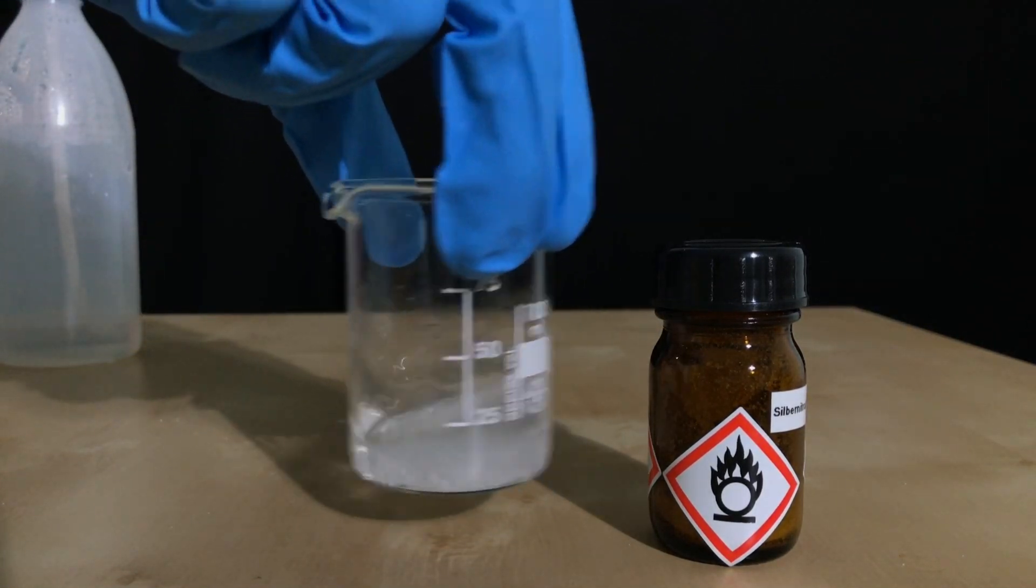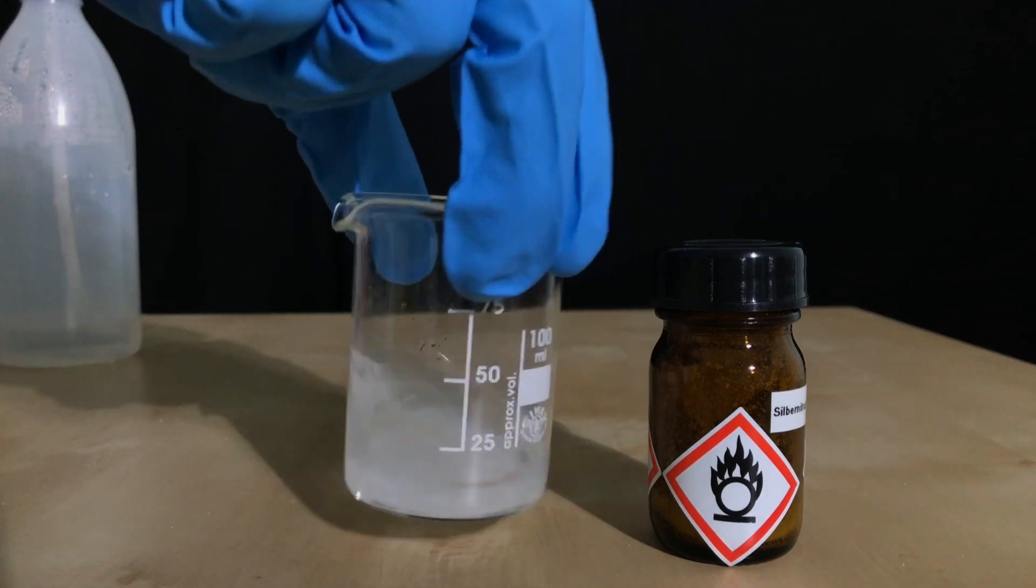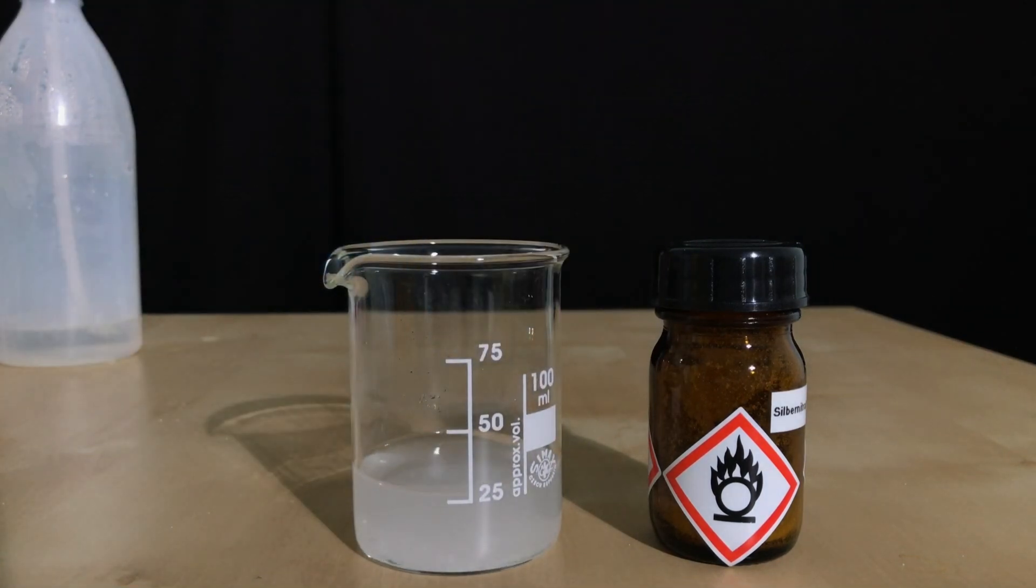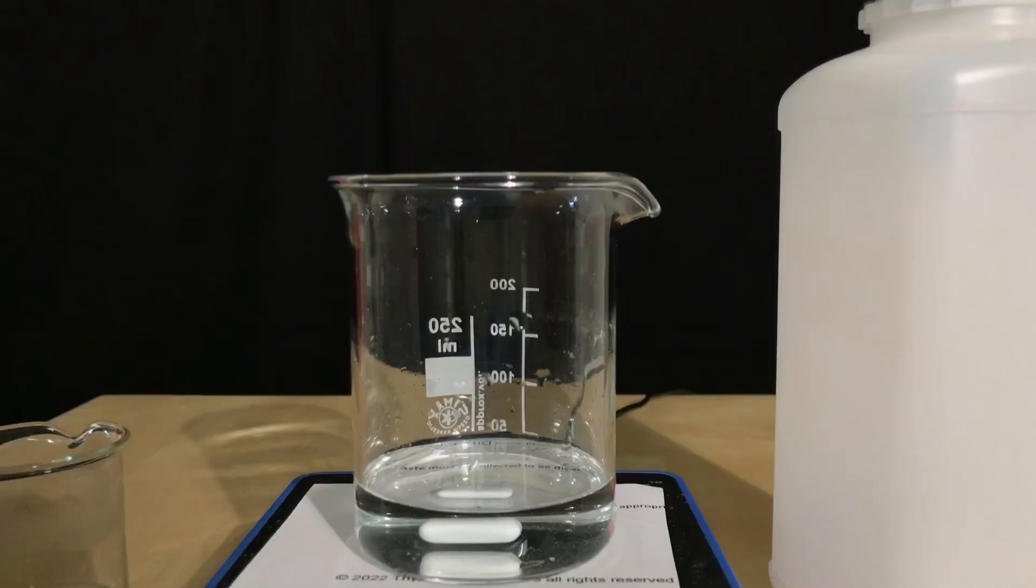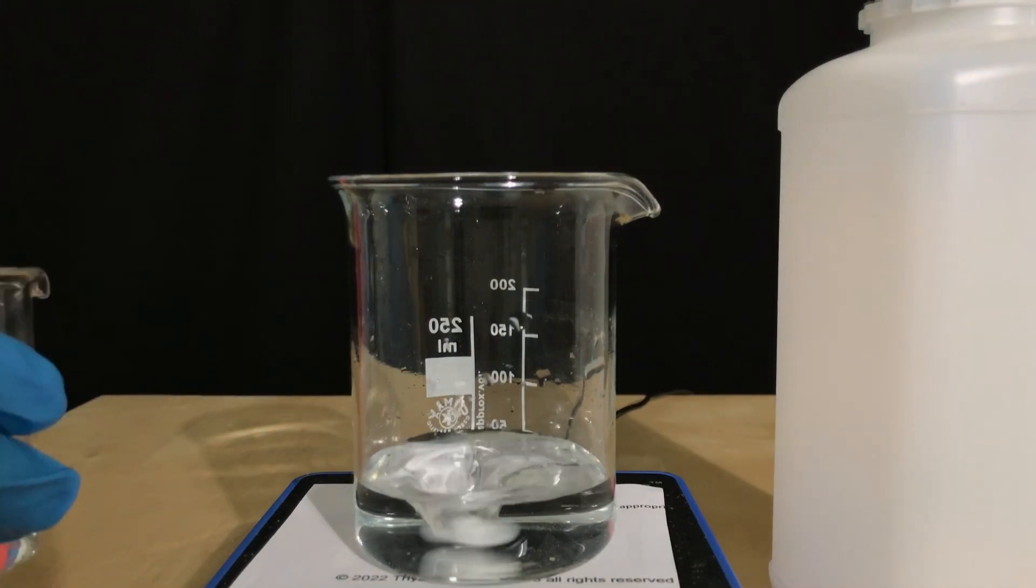Silver oxide is nearly insoluble in water anyways. Therefore, it doesn't matter if huge amounts of water are needed, because it won't have an impact on the yield. After turning on the magnetic stirrer, we are finally ready to start the reaction.